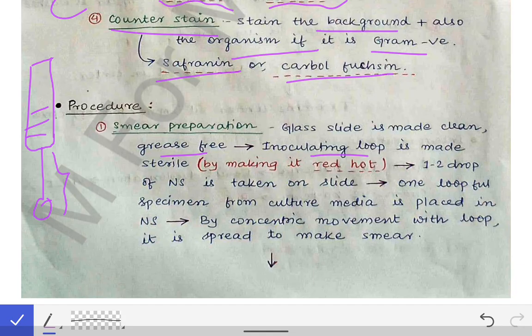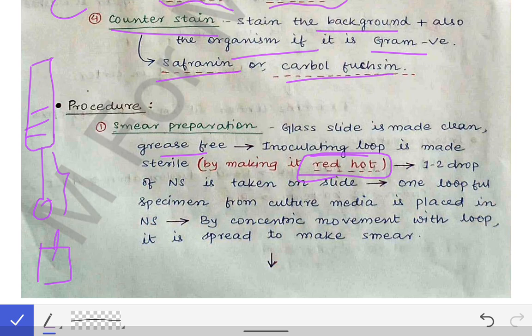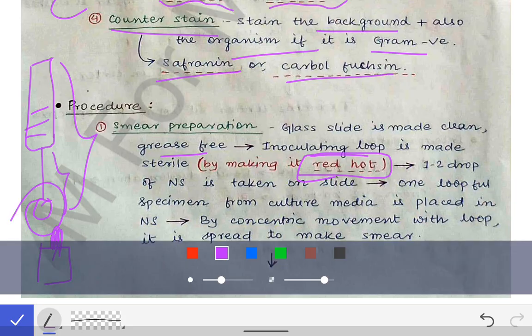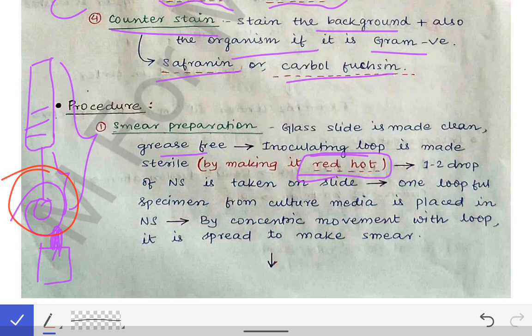We make the inoculating loop red hot — this is a method of sterilization. We keep the inoculating loop vertically at 90 degrees over the flame of the lamp until it becomes red. As it becomes red, that is called the red hot technique of sterilization of the inoculating loop.